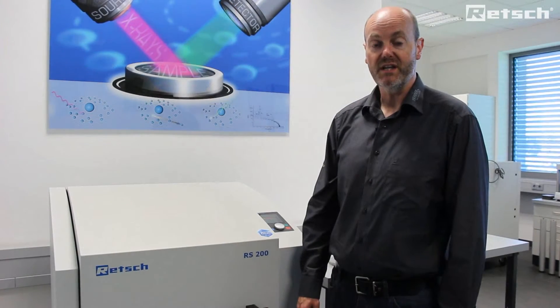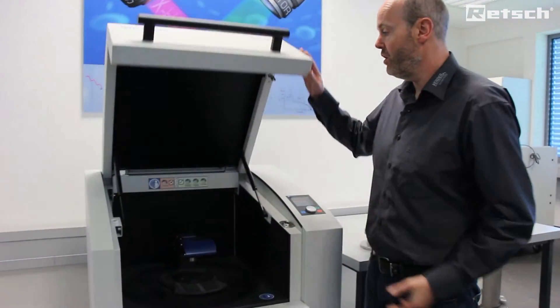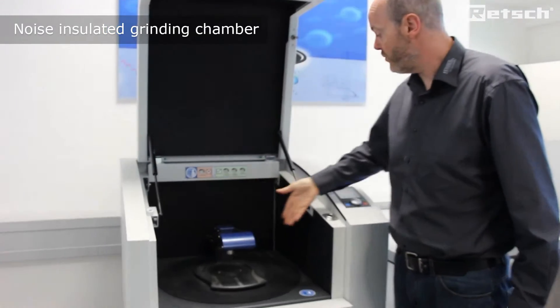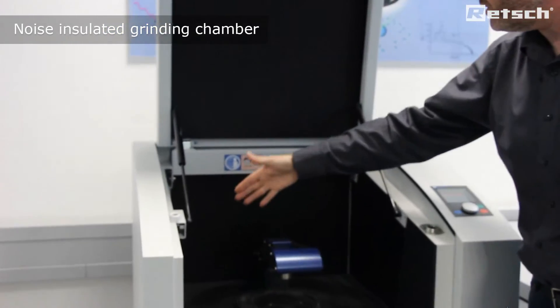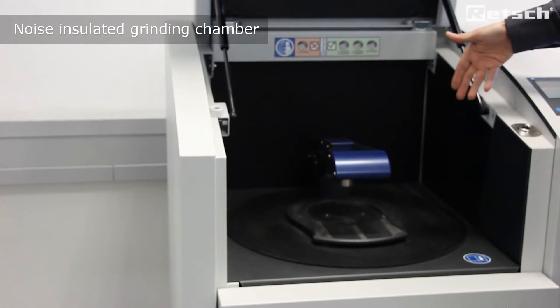The hood of the instrument is easily opened even with one hand, revealing the grinding chamber inside. The grinding chamber has noise insulation panels to the lid, the sides and the rear to keep the noise values to a bare minimum.